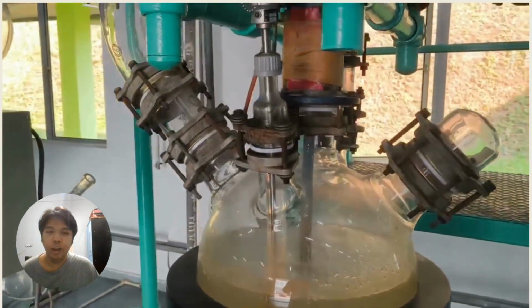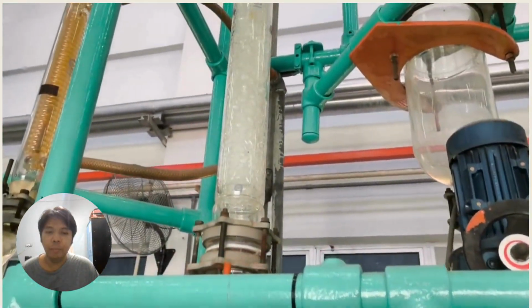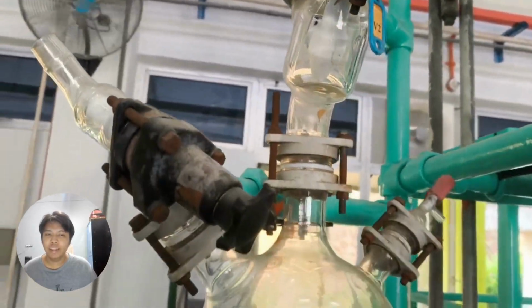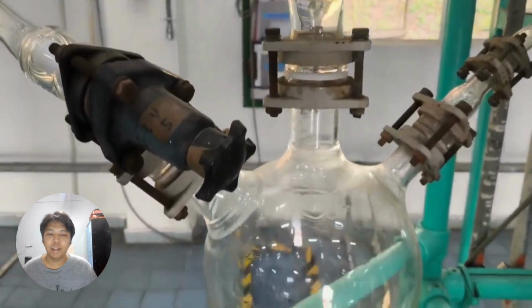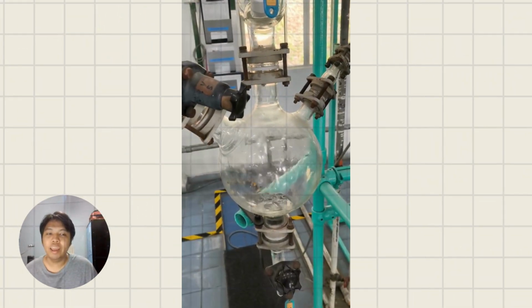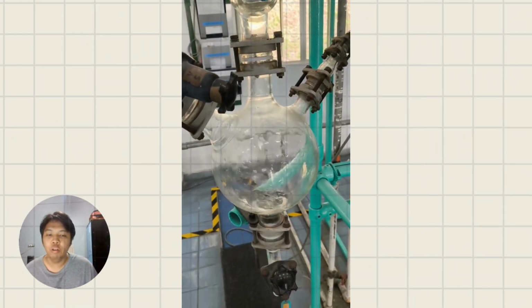Inside the reboiler, the liquid will evaporate and flow through the packing materials. Those volatile vapors will be sent into the condenser to condense the vapor into liquid, and the liquid will be collected in the flask below the condenser. The yield of liquid product in the flask indicates that the liquid extraction process is going on.